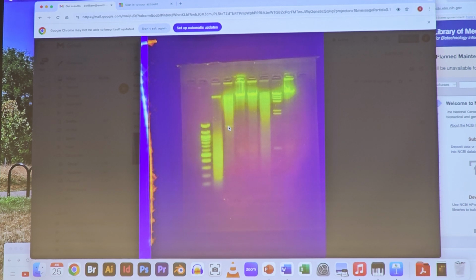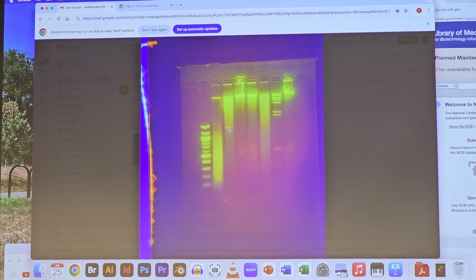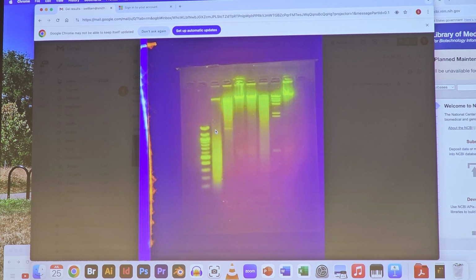A repeat, yeah. So not a VNTR, but another kind of repeat. The repeat we're seeing here is a repeat found in the mammalian genome called LINE1, or long interspersed repeat 1, I think. Anyway, LINE1. It's a repeat that is, as I recall, about 2,000 nucleotides long. It's scattered all over the mammalian genome. And the reason we're seeing a band here at about 1,300 or so is because this repeat sequence has 2 EcoR1 sites in it.